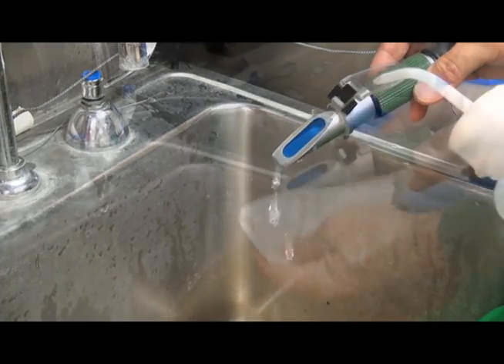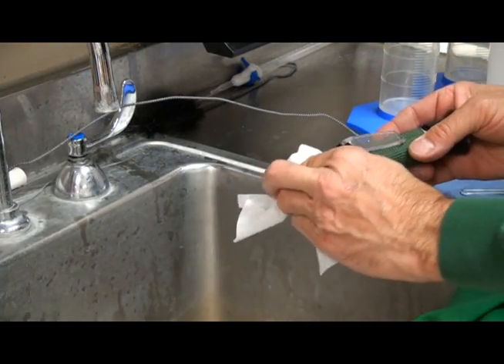Rinse the prism with DI water between samples, and wipe the surface dry with a Kimwipe.